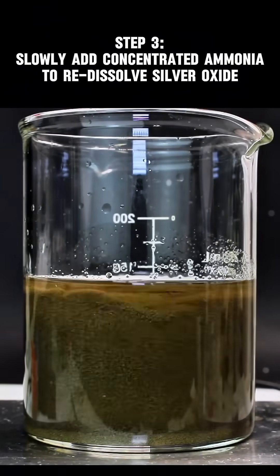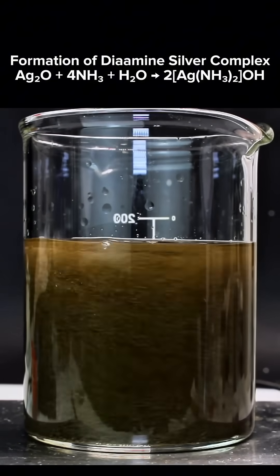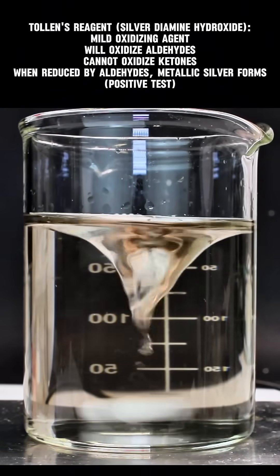As the ammonia is added to the silver oxide, you'll notice it begins to redissolve. This is due to the formation of a diamine silver hydroxide complex, which you can also do using copper, mercury, or nickel. Once the silver oxide is totally dissolved, my Tollens reagent is done and I'm ready to make some silver mirrors.